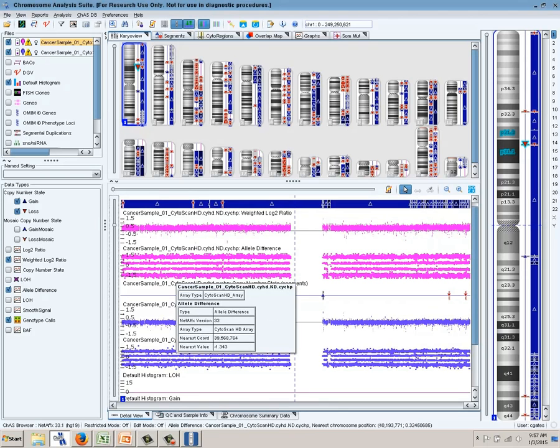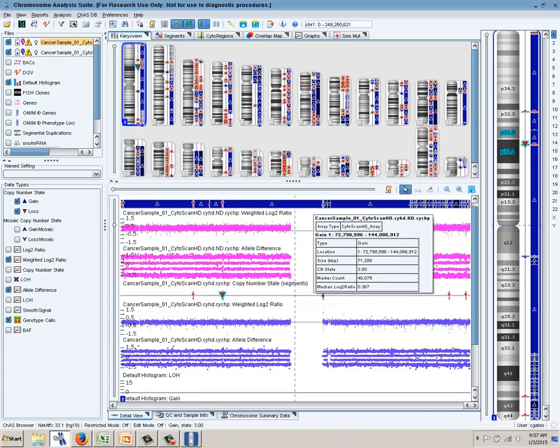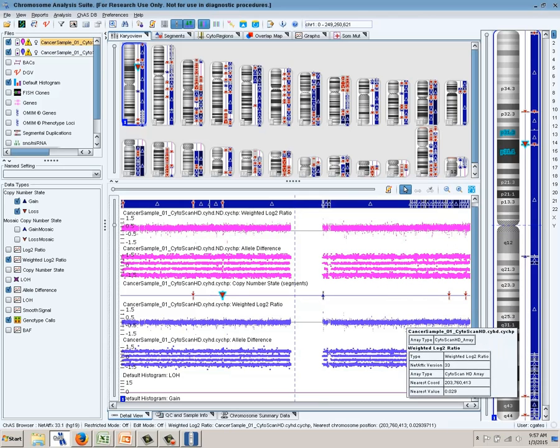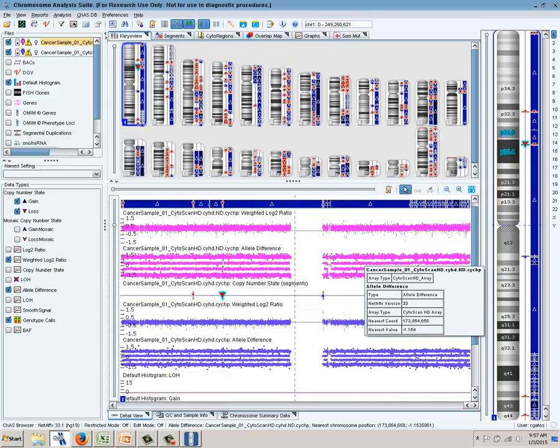Now let's go back up to the top, which is the sample run through normal diploid, and we can see we have a gain segment called roughly the whole length of chromosome 1. The log2 is now shifted upward, whereas on this sample it was centered around 0. We now see it shifted above the 0 line and 4 tracks. So now the graphs and the segment call are matching what we would believe to be for a gain.